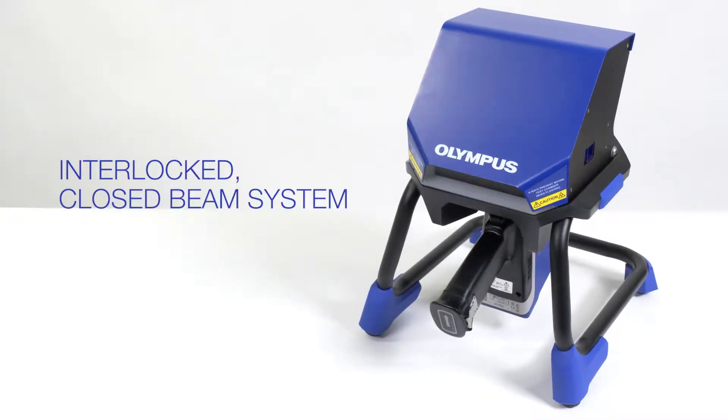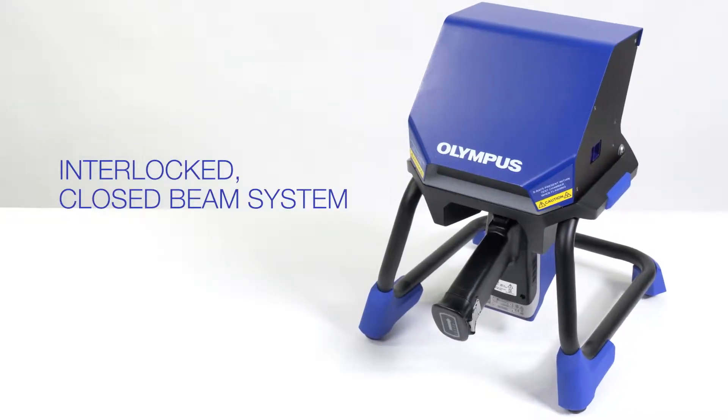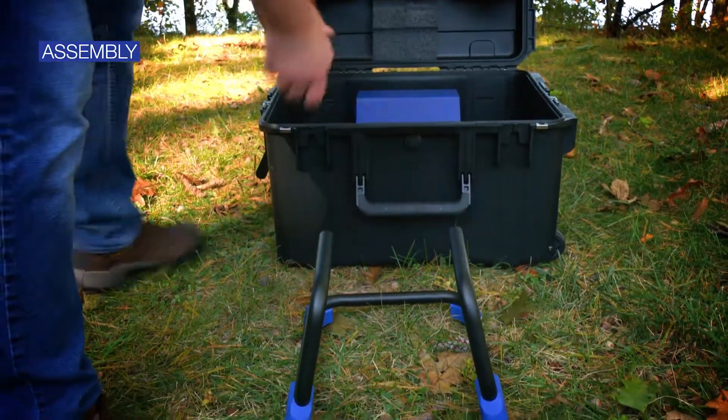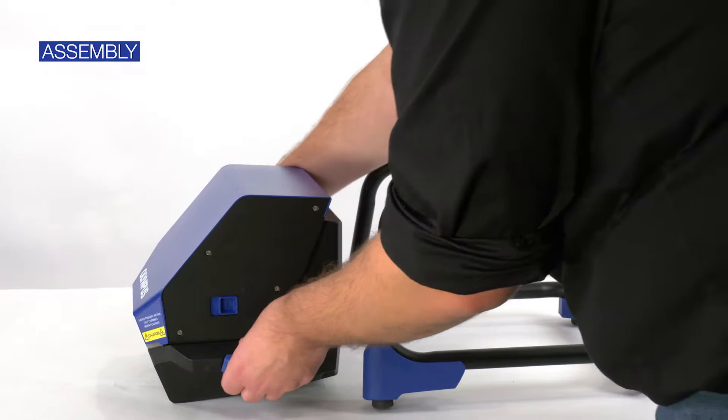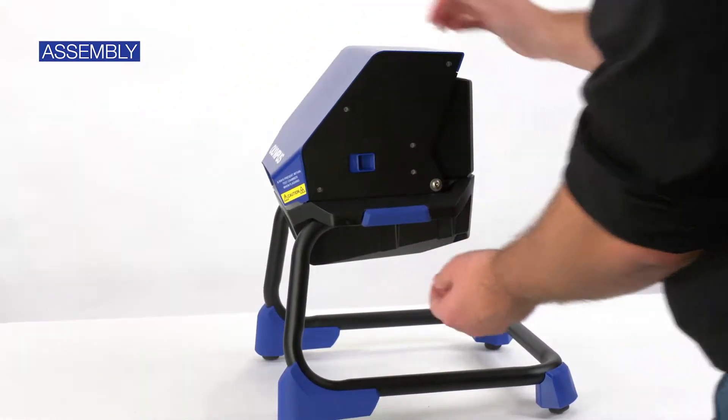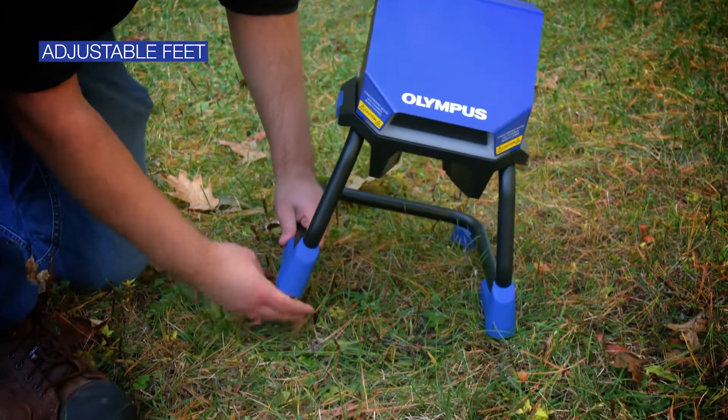The workstation is a fully interlocked closed beam system that's easy to use. To assemble it, place the chamber on the legs until it clicks in place. The legs have adjustable feet for leveling and added stability.